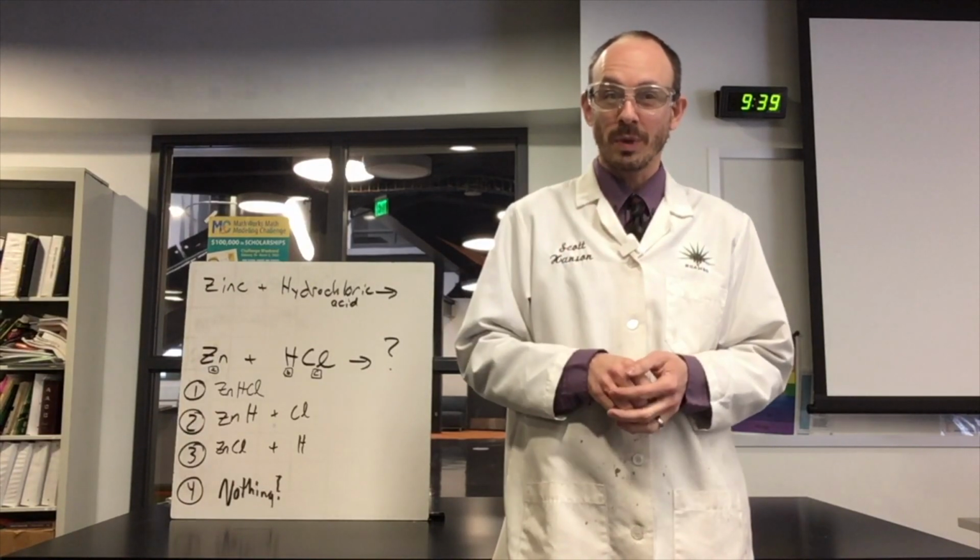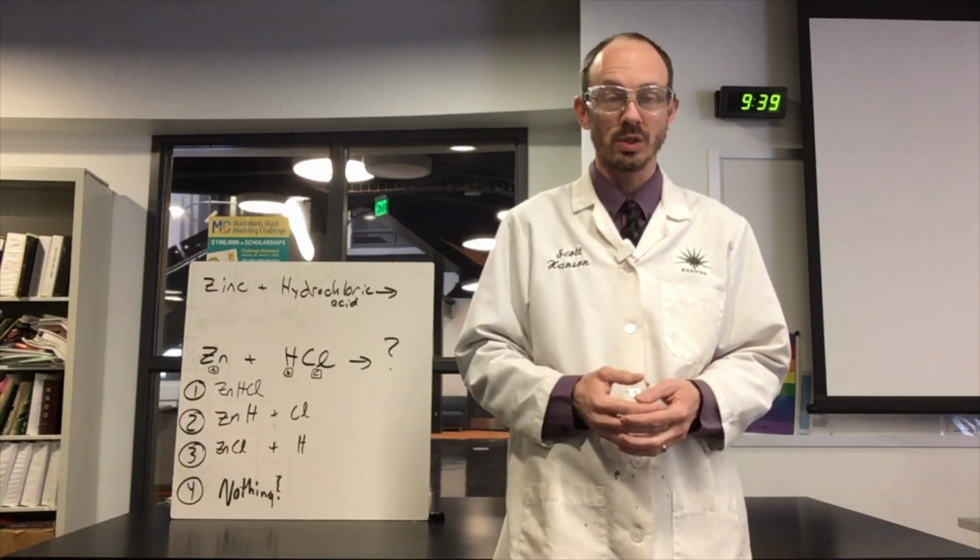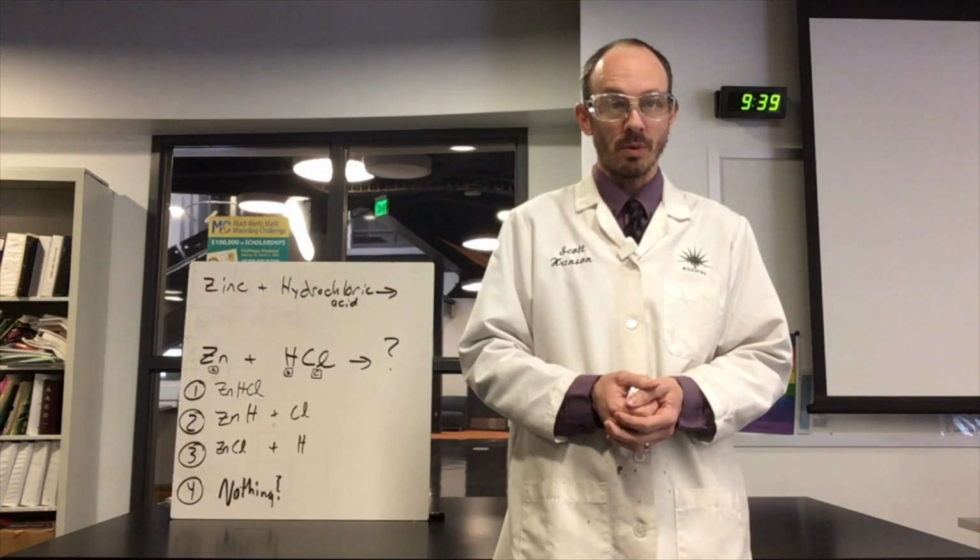And you and your group are going to be the ones that tell me which one of those two it is when you're writing up your CER board. You're going to tell Mr.